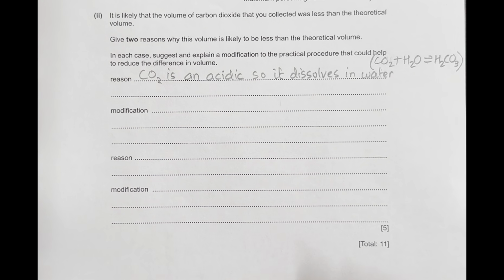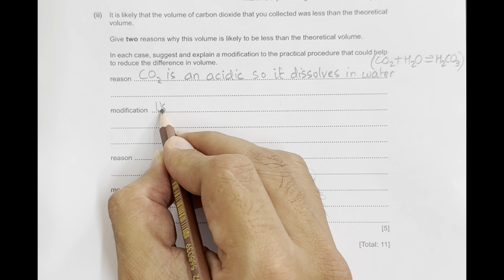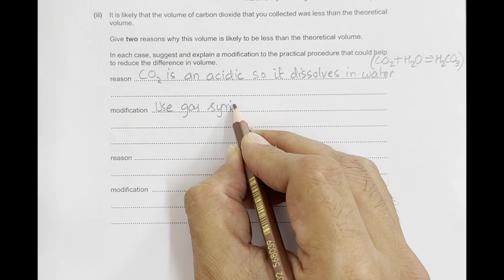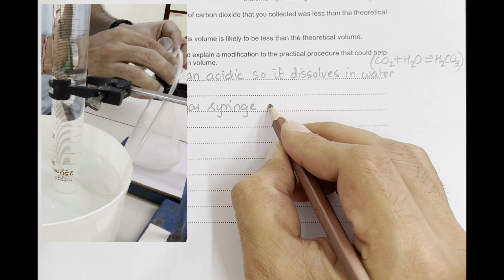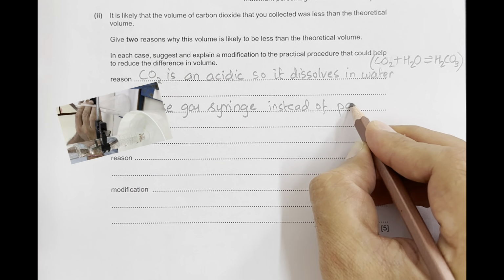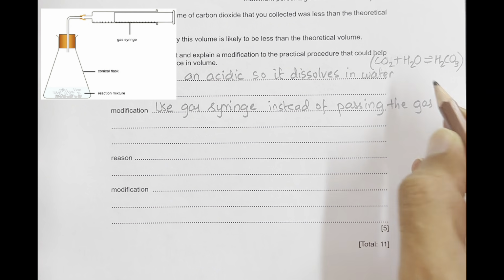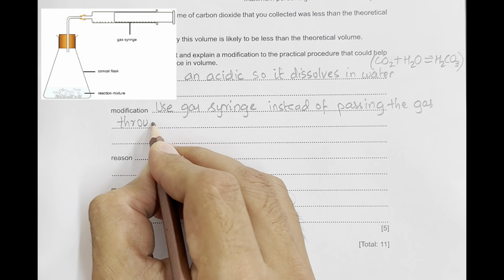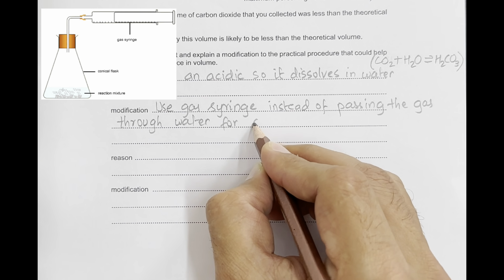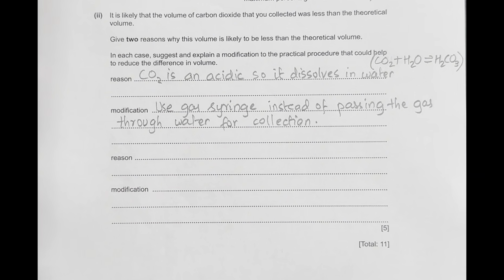Therefore, a modification we can suggest here is to use a gas syringe instead of a measuring cylinder, instead of passing the gas through water for collection. So this is one of the modifications that will improve our results.